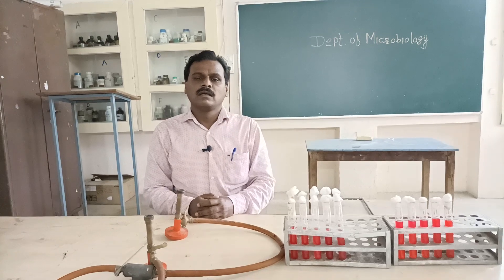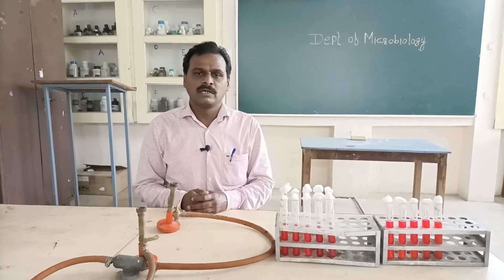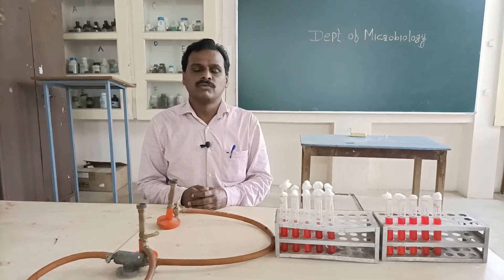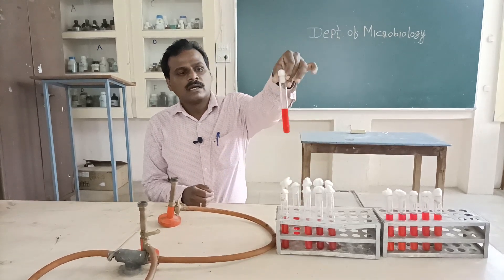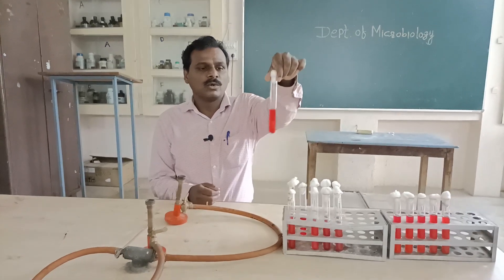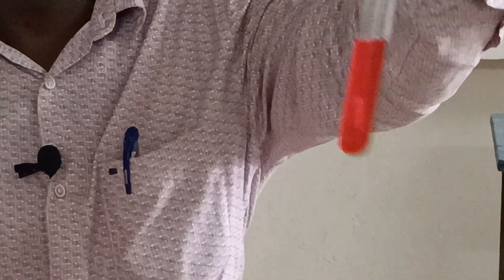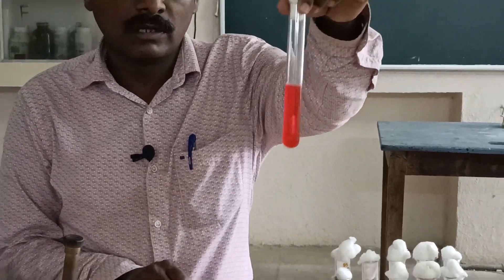All 15 tubes have been kept for incubation in the incubator at 37 degrees Celsius for 24 hours. After incubation, we can see that some of the test tubes have shown a change in the color of the medium, indicating acid production.